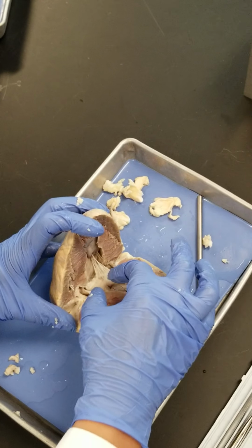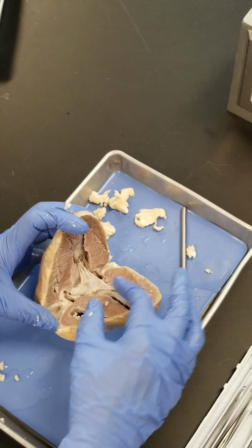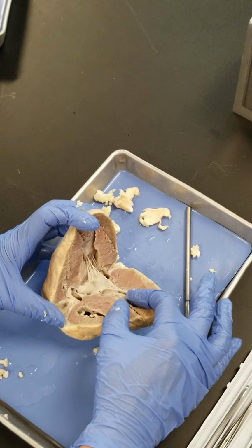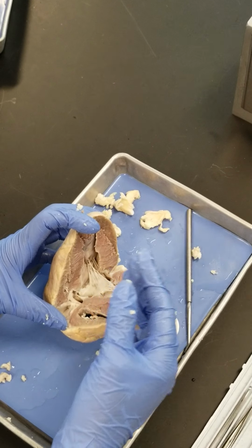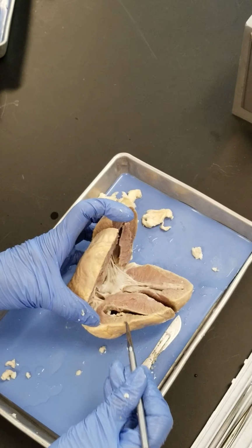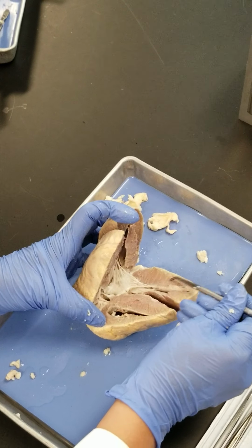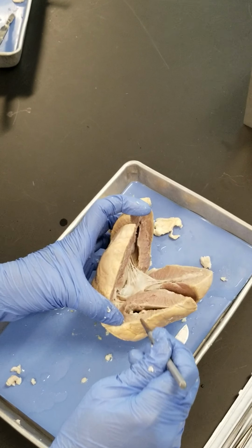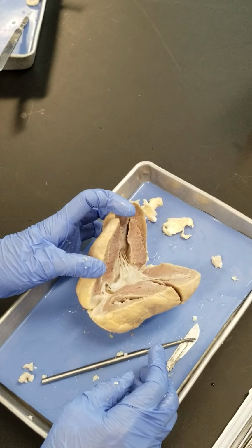Pay attention. You have a wall here, a septum, that is between the two ventricles. That one is not a free wall. That one is very thick, but that's not a free wall. That is the septum. Which septum? Interventricular septum, between the two ventricles. What we are talking about is the thickness of this free wall compared to the thickness of this wall. You see the thickness is much different between the right side and the left side. And that's all things that you need to find, right?